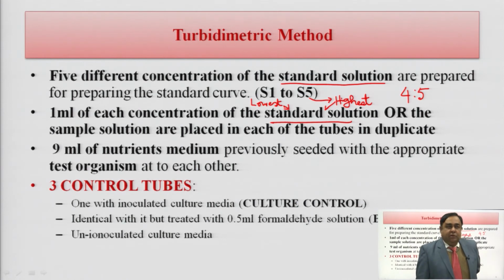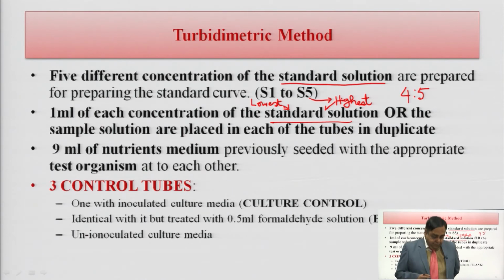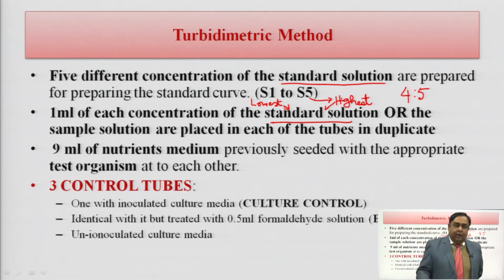Now, the question is, what is the dilution of the sample which you have to add in those 2 test tubes? You have a labeled claim on the package or the strip of the antibiotic.